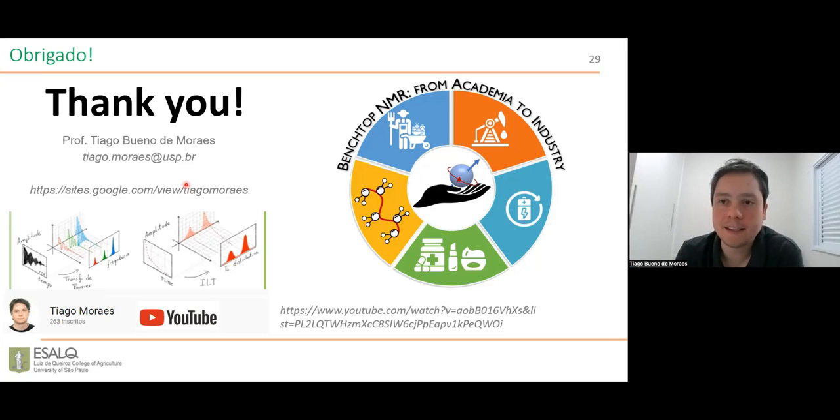I see in the scientific literature about new pulse sequences in these new low-field equipments, and even in the old low-field equipments, that the electronics of the system are evolving very fast. So the possibilities to implement different types of pulses, not only changing the times and the amplitude of the pulses, open many new possibilities in this field. That's why we have so many works in the literature about new pulse sequences for solid materials and for other materials that we typically have problems with in low-field equipment.